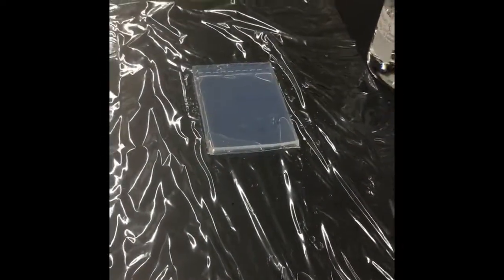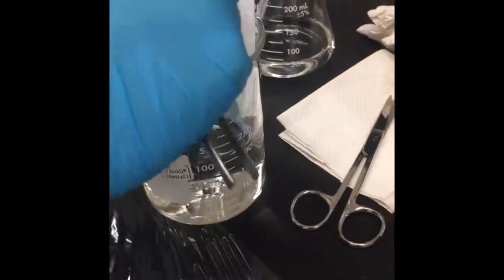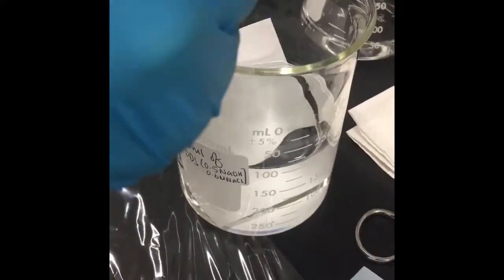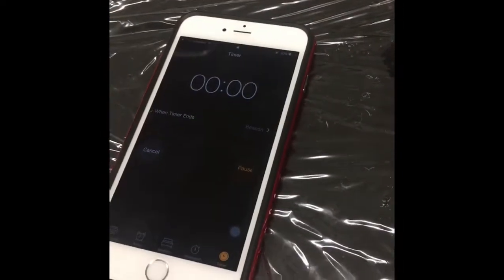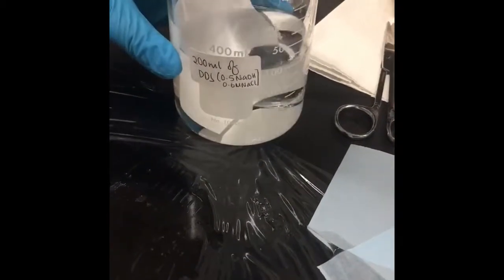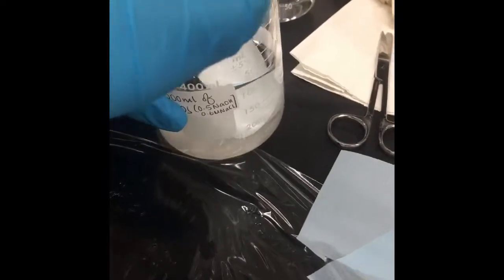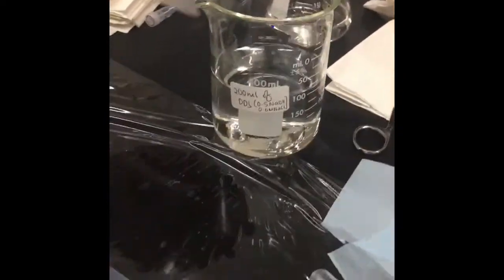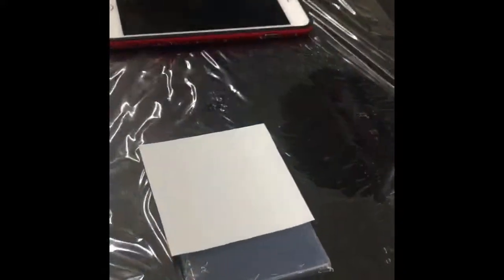Then we take out the gel and place it on a sheet of plastic wrap on the tray. The gel is placed well side down directly on the plastic. Then the nylon membranes are left in the denaturation solution. Once they're soaked, the membranes are taken out and placed on top of the gel on the plastic. We make sure there are no air bubbles.